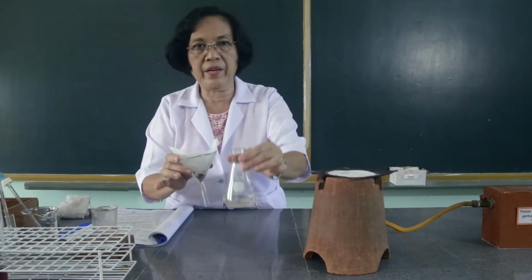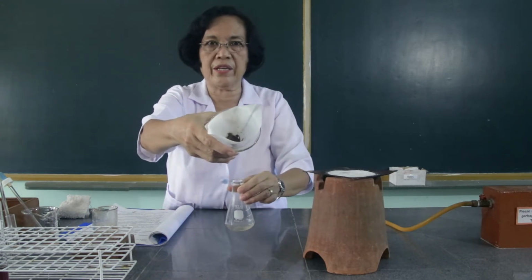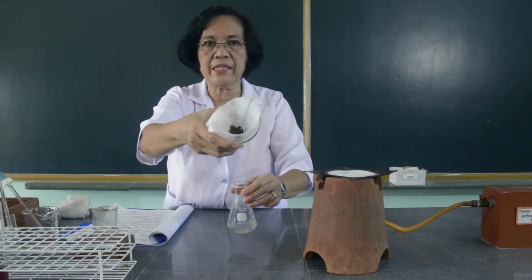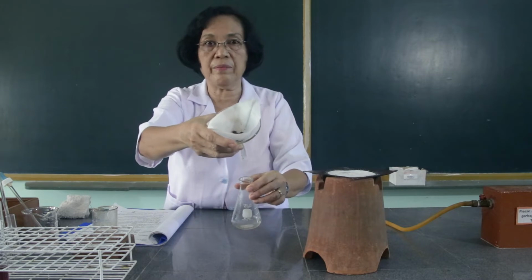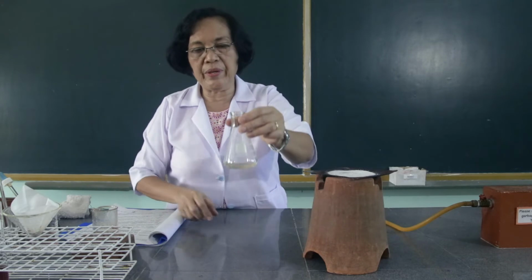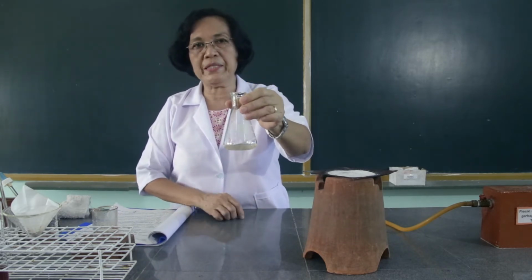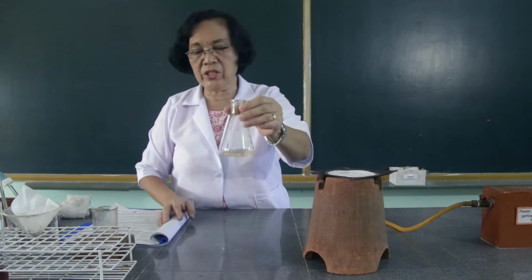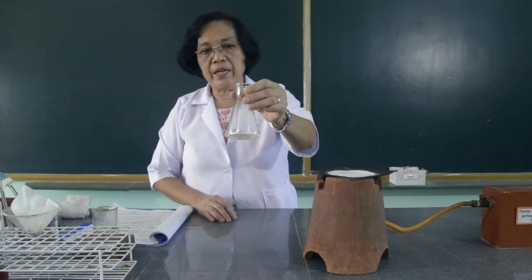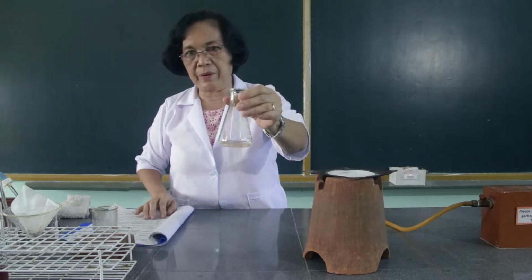So we have here the filtrate and we have here the residue. We will set aside the residue for the test for iron. So with the filtrate, we're going to divide this into 3 parts. One part will be submitted for the test for chlorides, the other part will be for the test for phosphates, and the other one is for the test of carbohydrates.